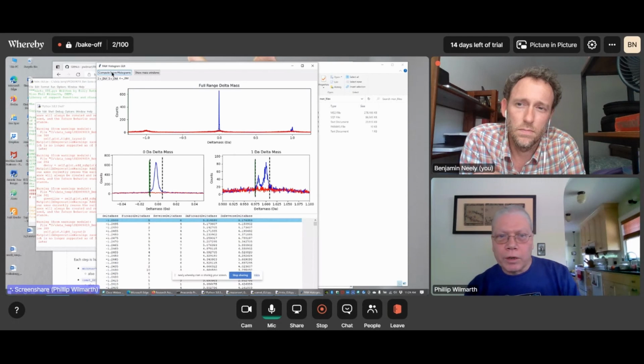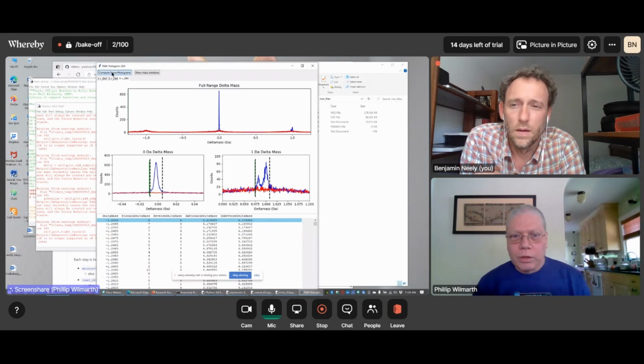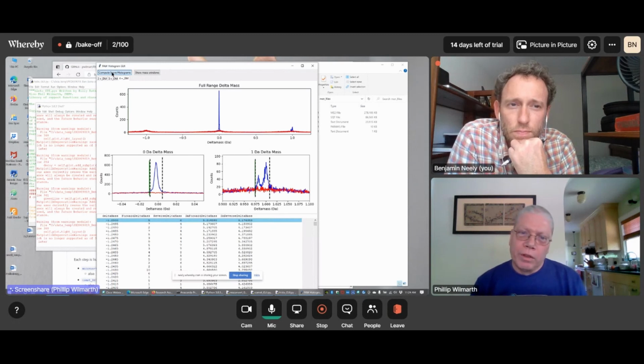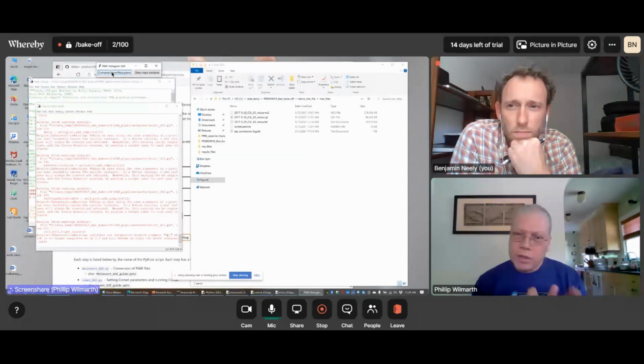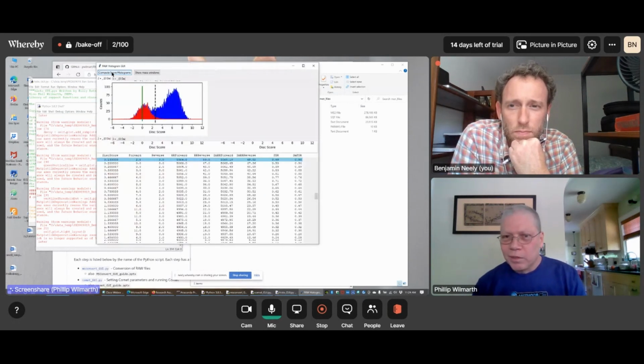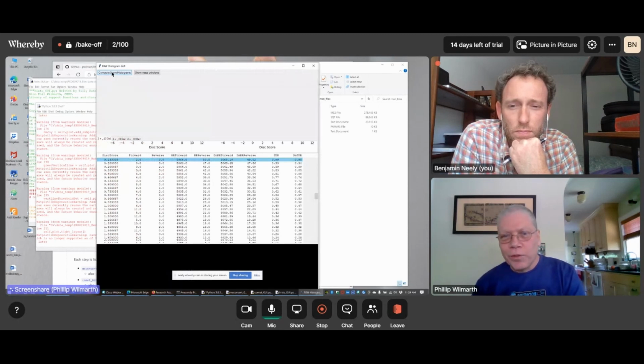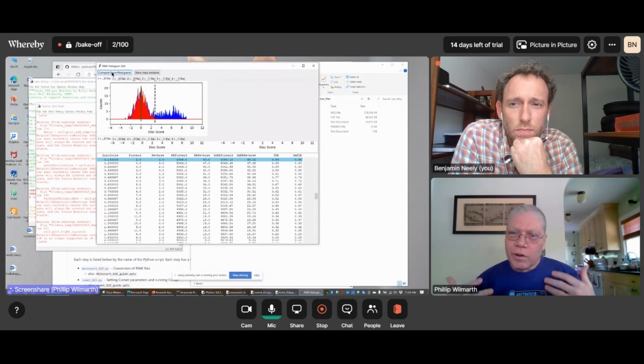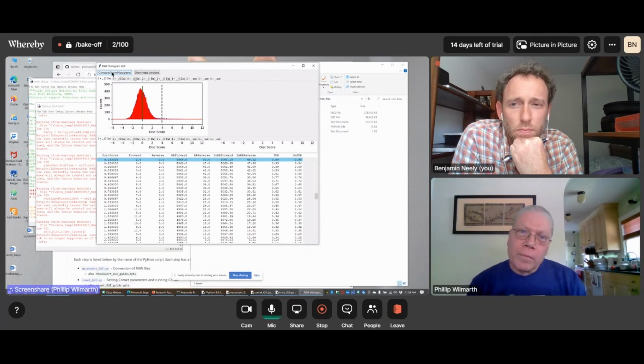We'll just compute score histograms. The score histograms are going to be dependent upon these delta mass windows. So we're going to look at our scores just inside that 0 Dalton window, and we'll look at our scores inside that 1 Dalton doublet window. And then we'll also look at our scores for any delta masses that weren't inside either window. So everything else that's in there.